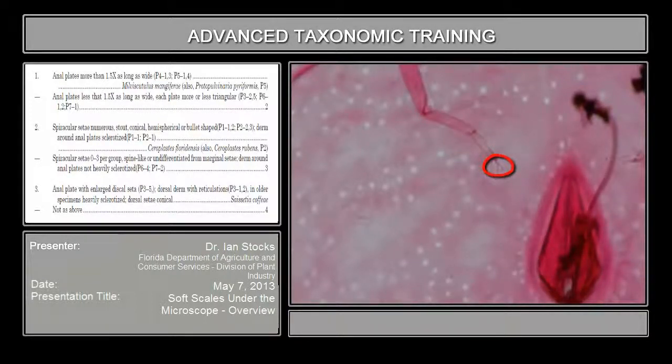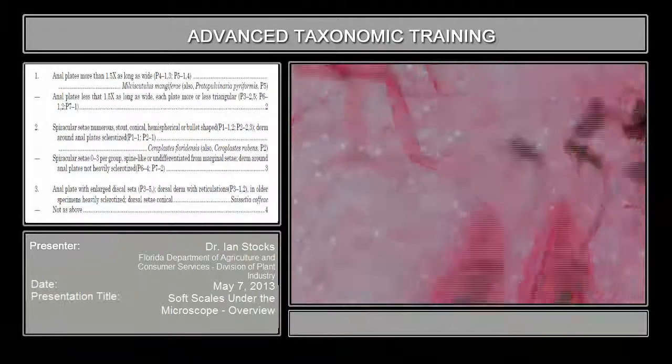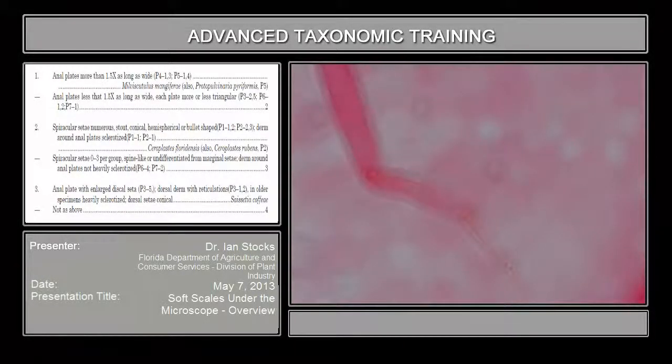And like they have in the mealybugs, there are these paired structures that look a little bit like spatulas. They're the digitules. This is the tarsal digitule pair. The tarsal digitule pair is the long pair here, and the claw digitule pair is the one that is more spatulate.